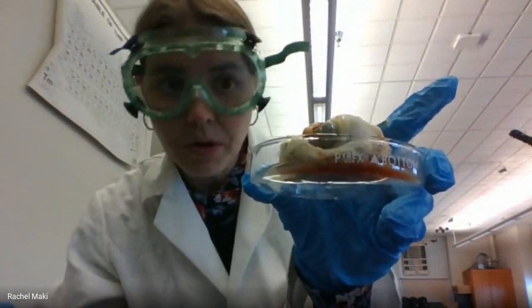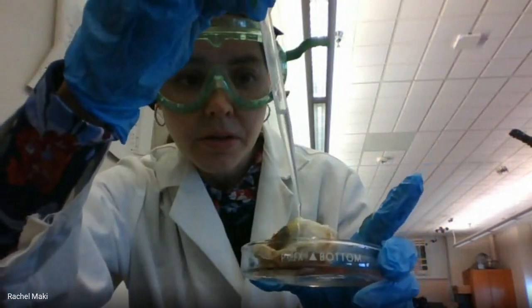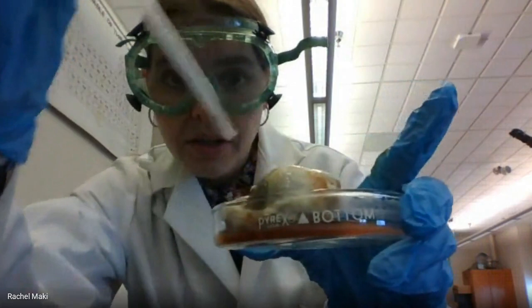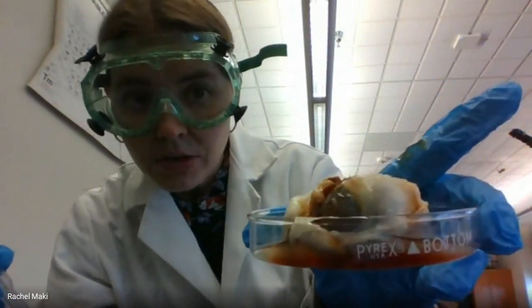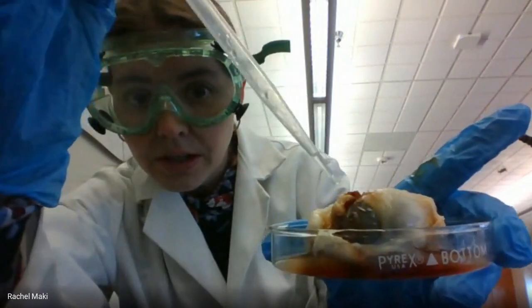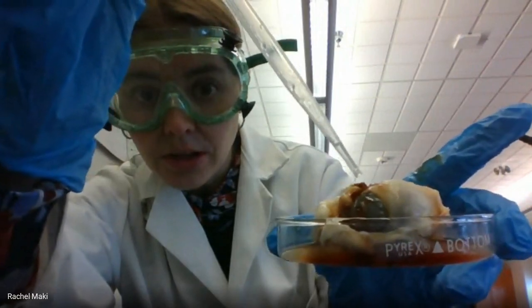Let me put a little bit more on there for you. I don't know if you can see, but it is smoking. My container here is getting hot. The eye itself is actually starting to cook. You can see right here, it's getting darker in color, because it's actually, literally, the acid's cooking it.